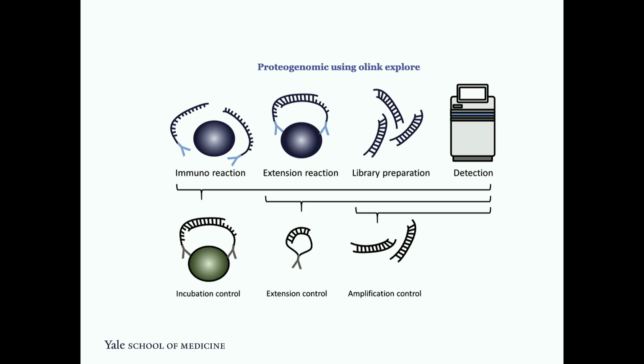It comes as a mixture, so you take the mixture, add it into your sample, and then everything happens. 11,000 is the maximum.